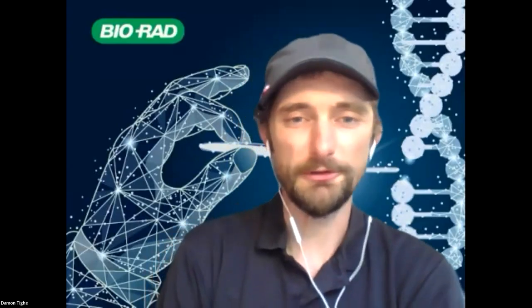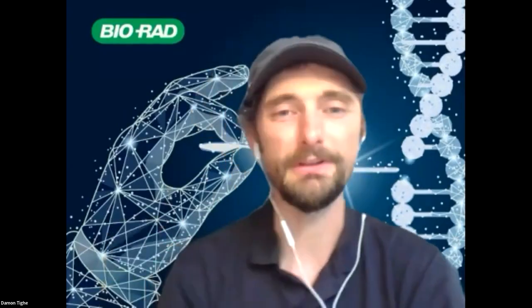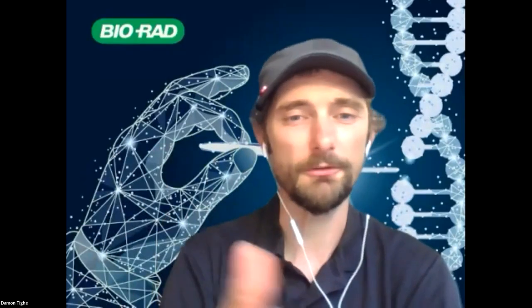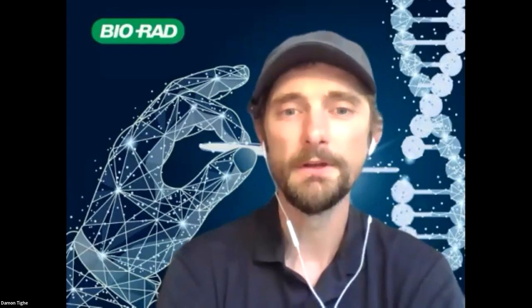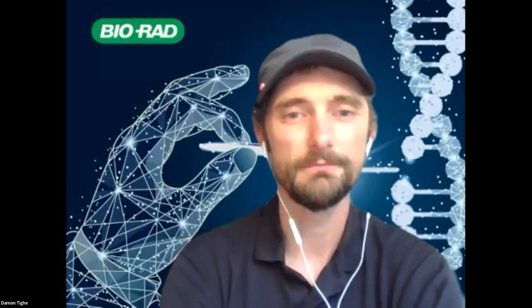Yep, you could use other proteins for this lab. You're not restricted to using milk and a high protein drink. You could use pea proteins. You could extract proteins from nuts, and actually I think that is part of the other webinar that Vernier and I did last year, where we show how to do that. So you can bring in whatever source of protein you want as long as you can get it into solution.